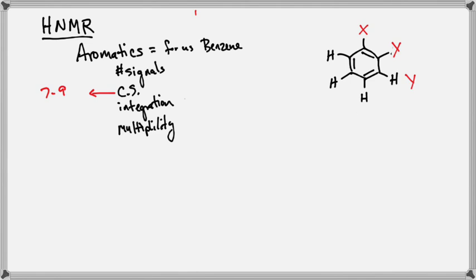Okay. So let's start drilling into some of the deeper context that we can pick up. So let's just go back to our simple one. What's going to be our number of signals? Hydrogen. It's hydrogen. This is HNMR, our number of signals.